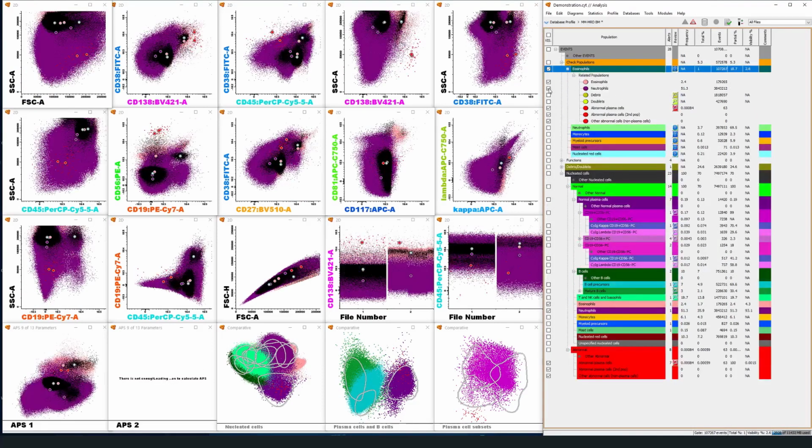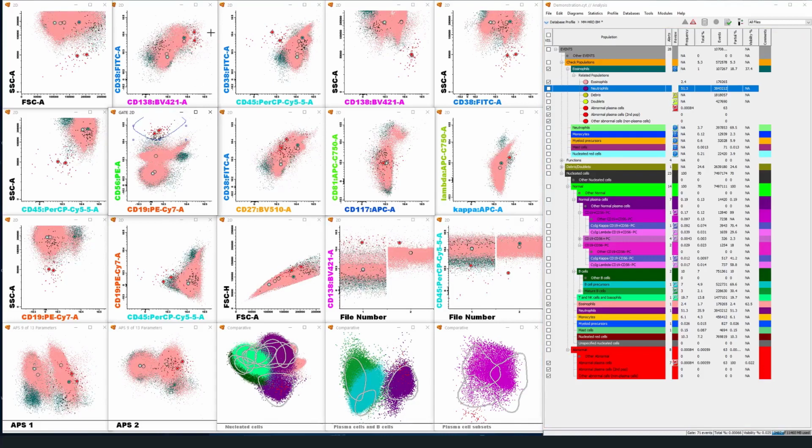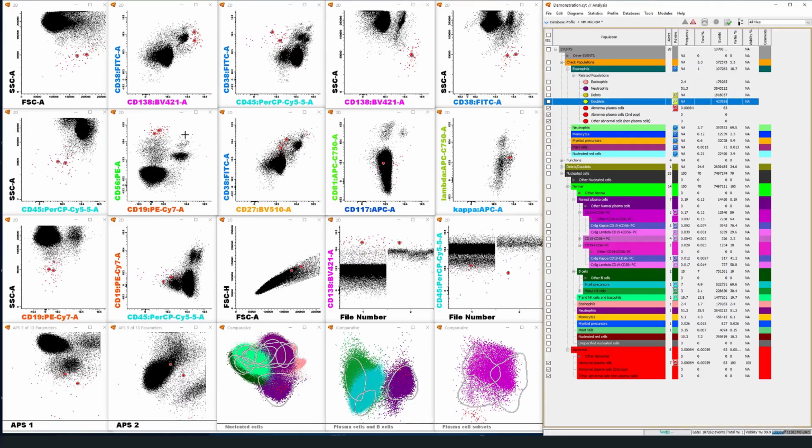Eosinophils tend to have unspecific staining, or at least they appear to fluoresce sometimes into different channels, so their phenotype is somewhat unpredictable usually, and they can have subpopulations of CD56 apparently, but it's not real expression of these markers. So in this case there doesn't appear to be many cells that enter the specific malignant phenotype, but for these ones I may assign them because they are, although some of them are too large, so that would probably be doublets or debris or just eosinophils. But in any case, no major cells appear to be, and I'll show at the end, just looking through all the populations and assigning them according to phenotype.